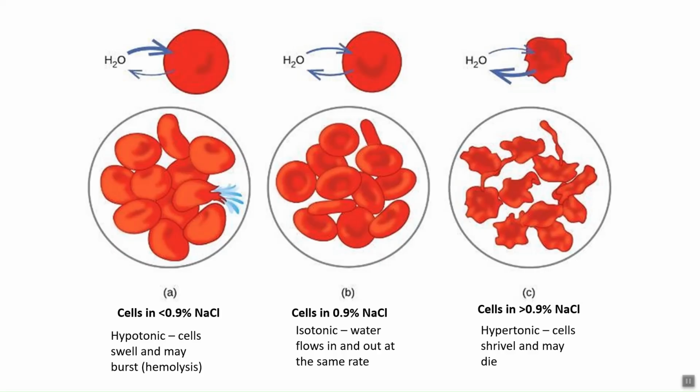So this is basically just a little introduction to osmotic pressure and osmosis, and it's not super important here, but it is what we're trying to do. We're trying to figure out if the unknown solution is basically safe to be used inside of a person. Obviously, it's not actually safe because it's not sterile or anything like that, but we're trying to determine whether or not, if we work for a company who makes saline solutions that go into IVs to put into people, does it have the right concentration? Because as you can see from this, it's very important that it has the right concentration.